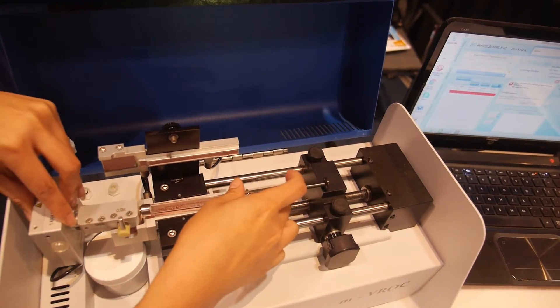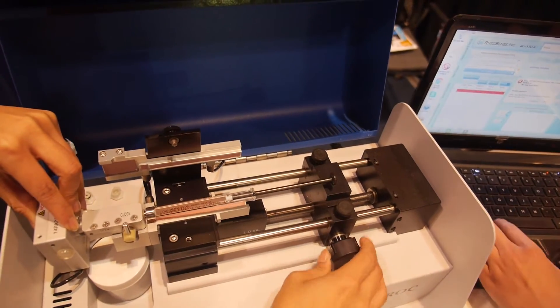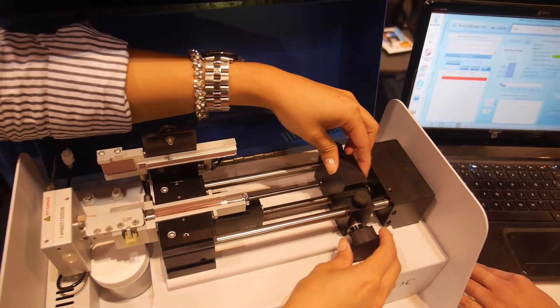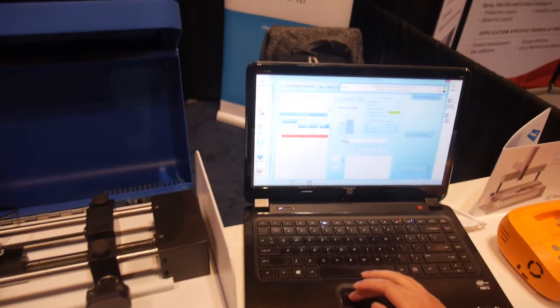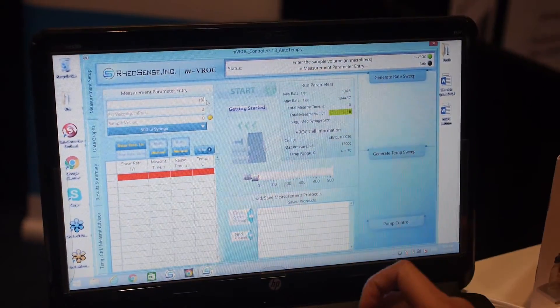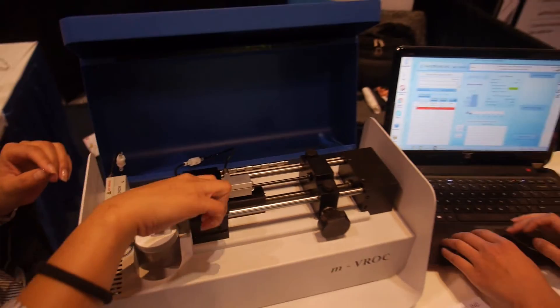Once it's secure, you just place it in and tighten up the pump. It's connected to the computer — this instrument, or viscometer, connects to the computer and communicates with it. This software is capable of shear rate and temperature sweeps.